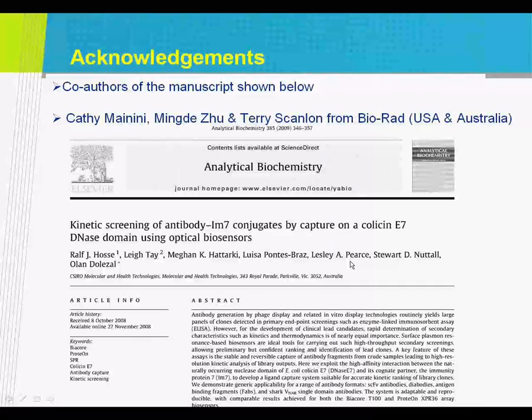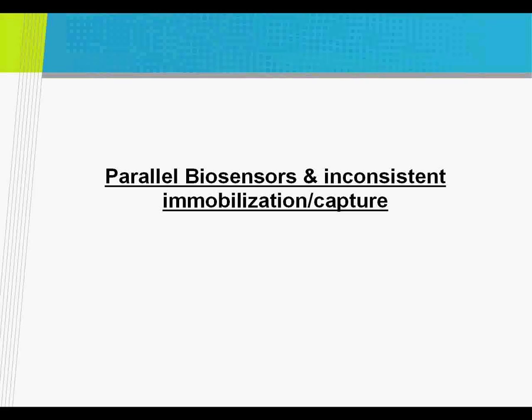This just shows what can happen. In this case, we injected the biotinylated peptide onto a streptavidin surface. So we immobilized streptavidin on a GLM chip, and we found that each of these spots had a relatively different amount of protein immobilized. I did this maybe 6 months ago, and since then I started learning how to do this a little bit better. But the point I'm trying to make is that this will happen, for whatever reason. And how do you deal with it? Do you try to immobilize another channel, or do you not worry about that?